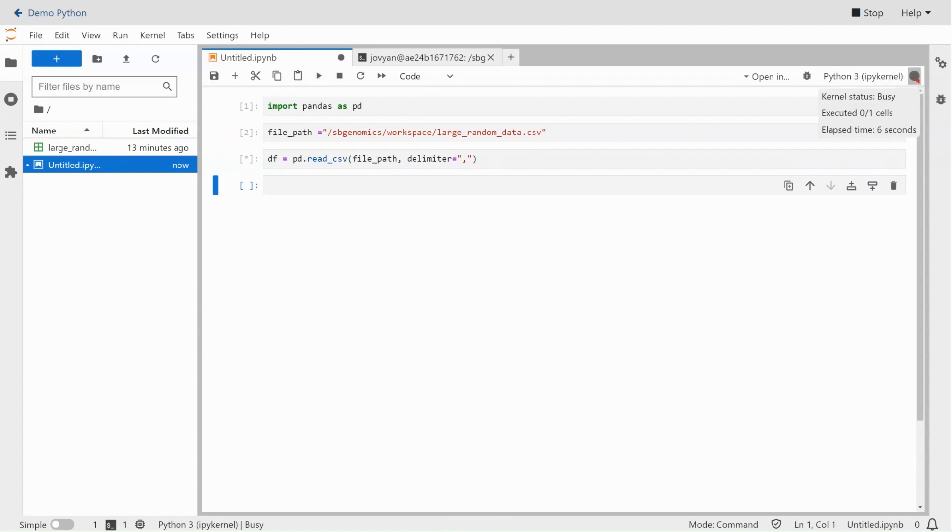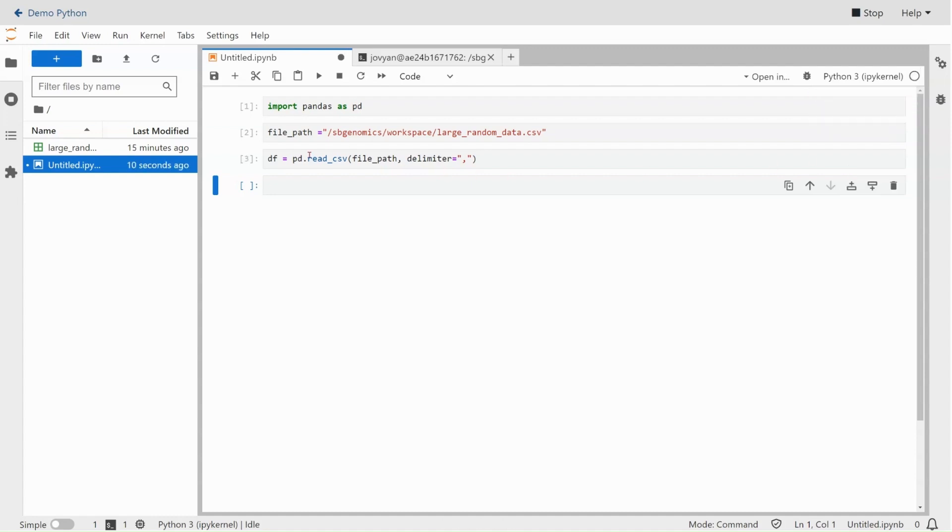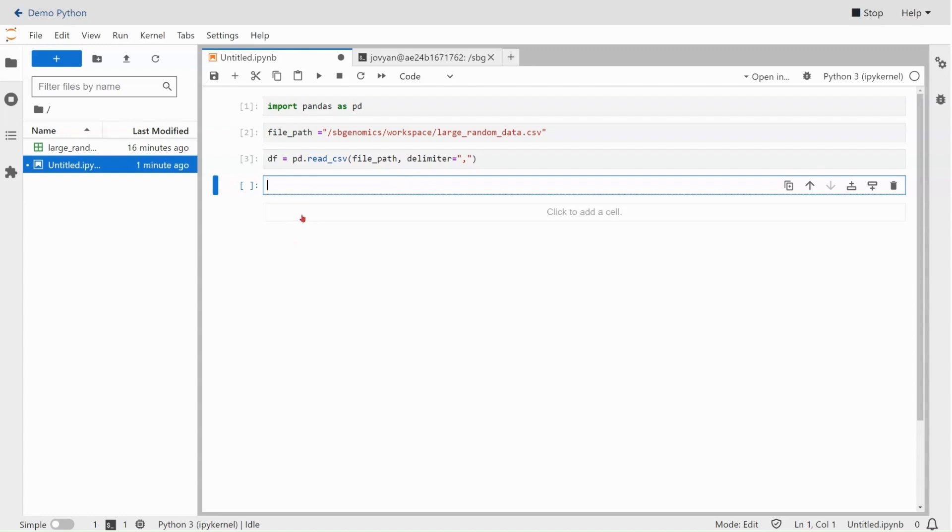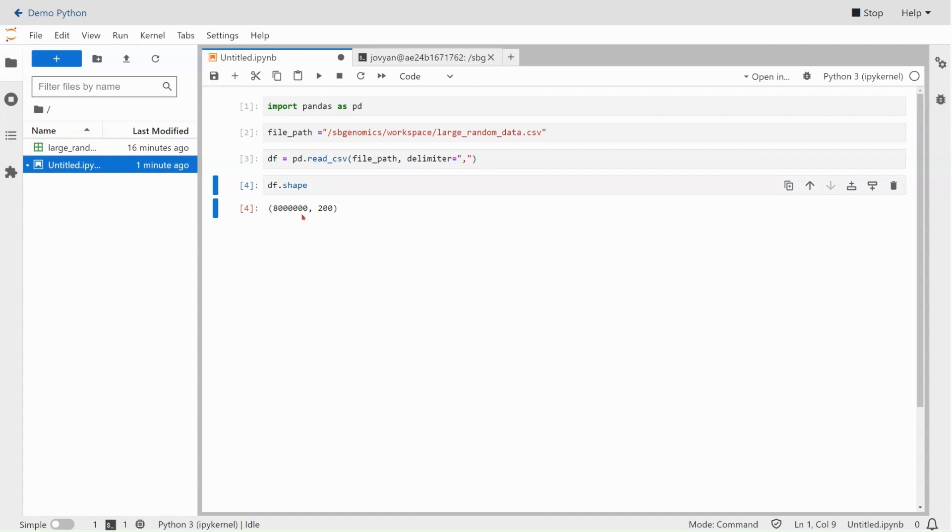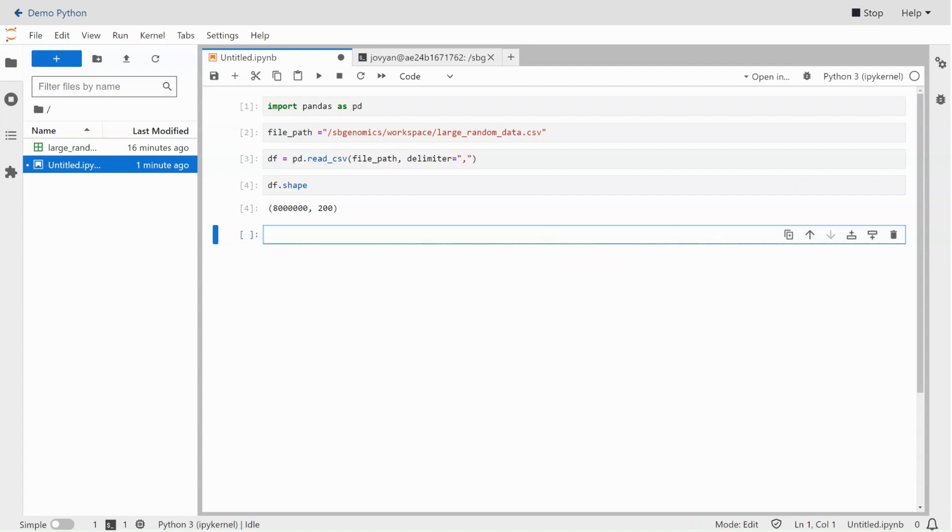One advantage of an ipython notebook in JupyterLab is that while the kernel is busy, it will show you that it is still doing something with this black circle being fully shaded in. Once it is finished, that circle will be an empty white circle. And there we go. So now that this has been read into memory, we can check the shape of it and then modify it and write it back out to a file. We will use df.shape to get the dimensions of this data frame: 8 million rows, 200 columns.